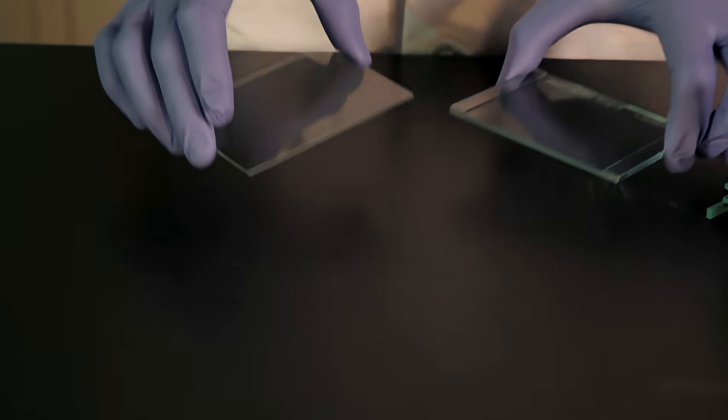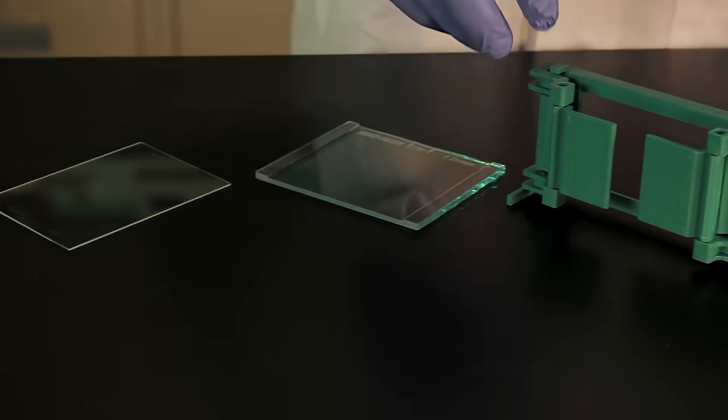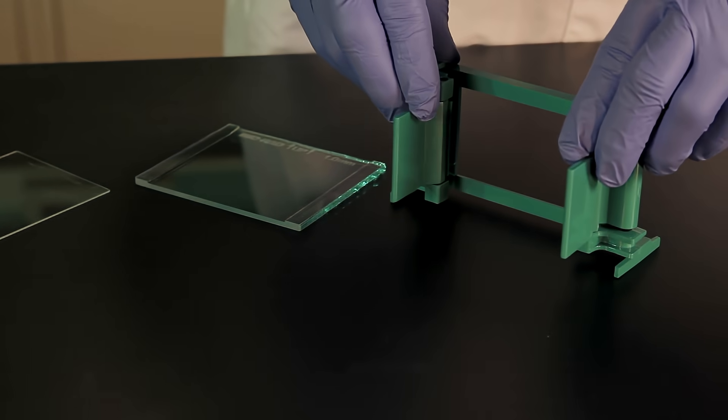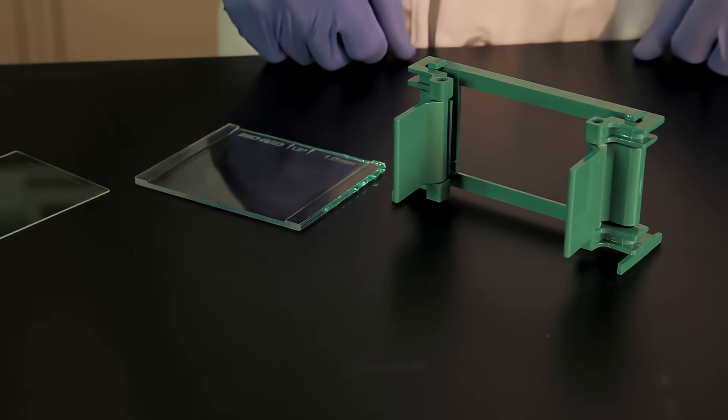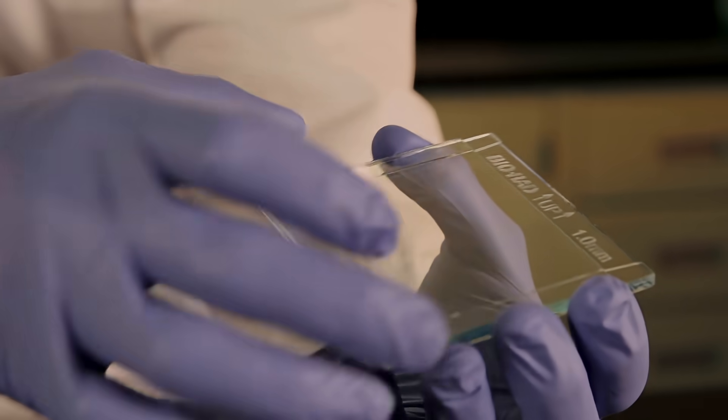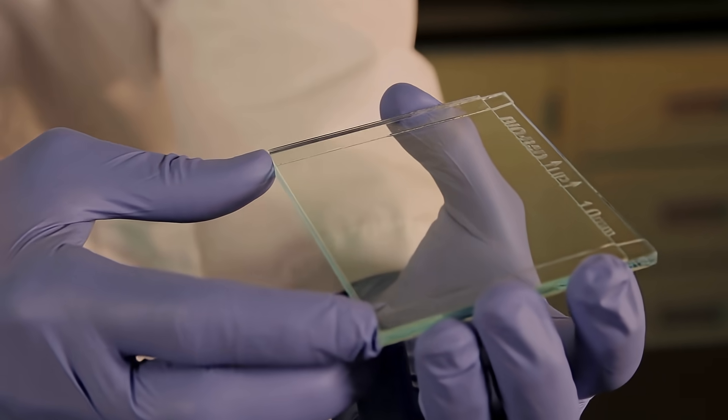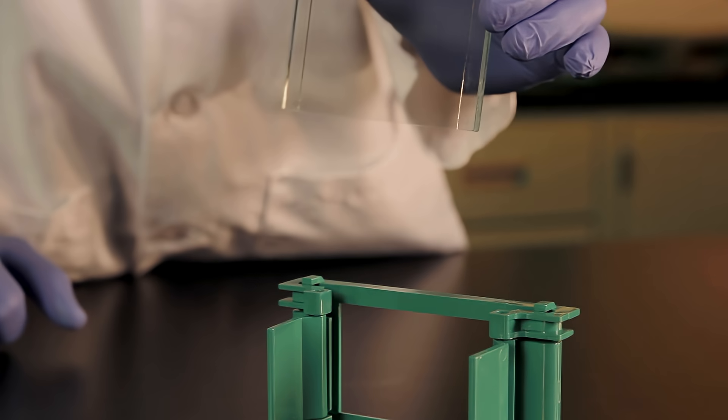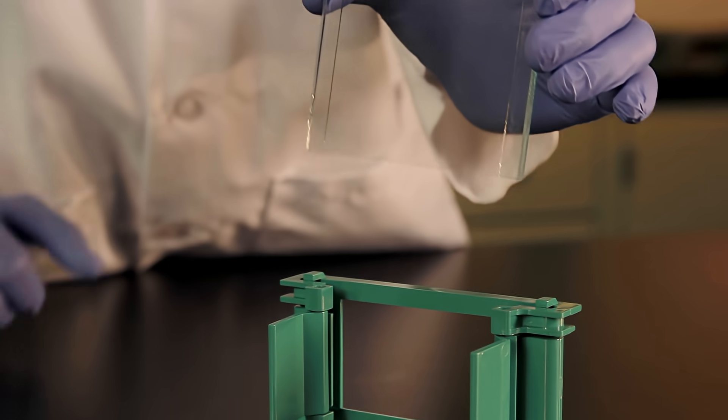Take care to ensure that all glass plates are clean and dry. Place the casting frame upright on a flat surface with the pressure cams in the open position. Select a spacer plate of the desired gel thickness and place a short plate on top. Slide the two glass plates into the casting frame.